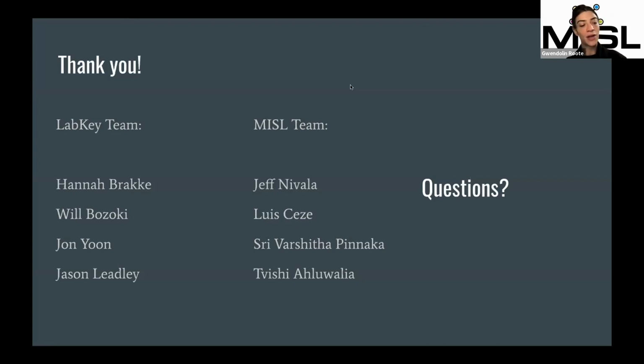But after having IDT send us this whole very large CSV file with all of the information about all the samples that we had ordered, we were able to port that into Sample Manager fairly easily and have all of the information of all those samples become searchable automatically. We didn't have physical locations from the get-go for that, but we do have all the information that we needed about what the samples actually are. So that was really great.